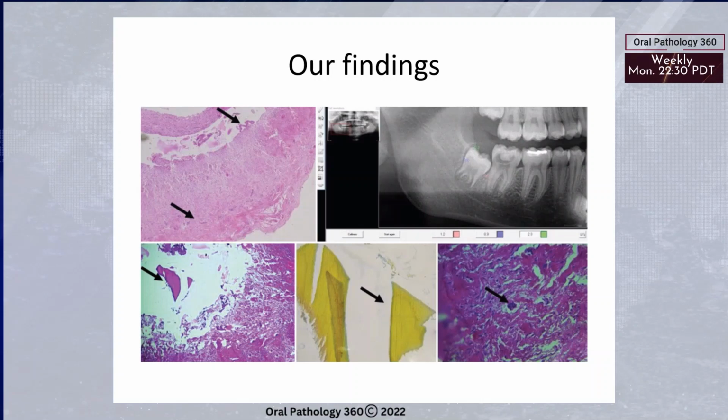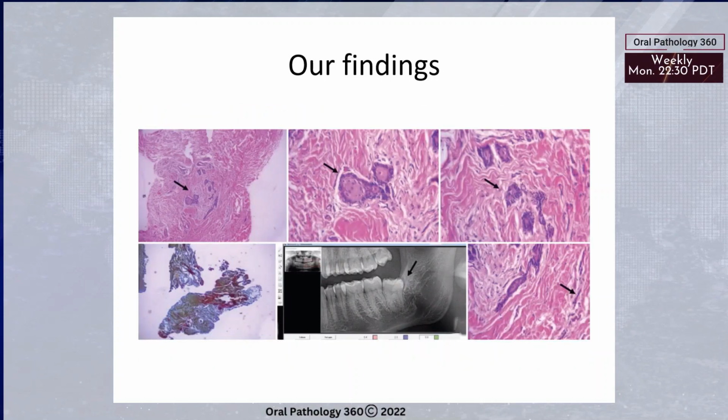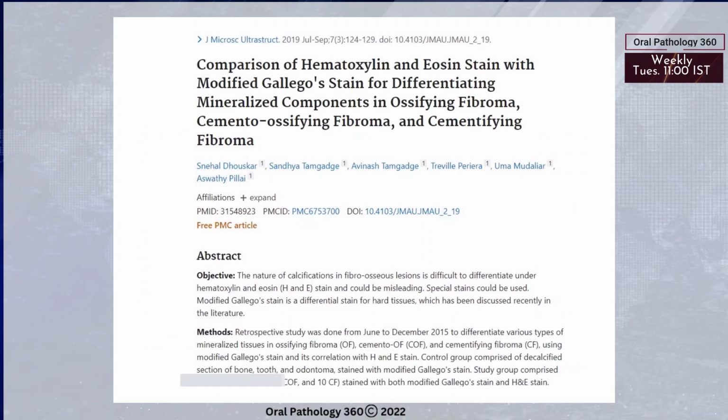So we found various types of histological features, like sometimes odontogenic islands were seen, epithelium was showing odontogenic changes, and in the stroma some calcifications, and we could identify the nature of the calcification. So these are the asymptomatic dental follicles showing some odontogenic tissues, odontogenic islands.